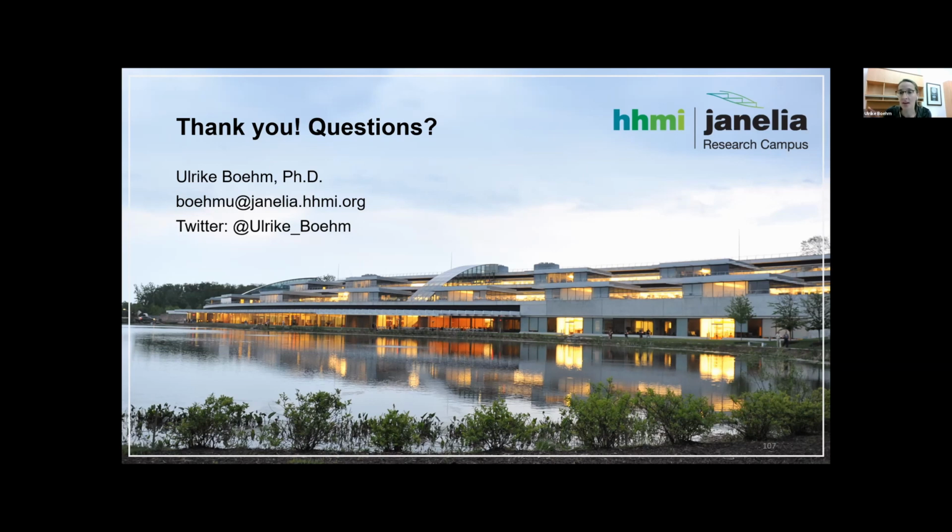So they don't have the entire cryo flow, which is something I would really like to see in future, because then you keep the integrity of your sample all the way intact.